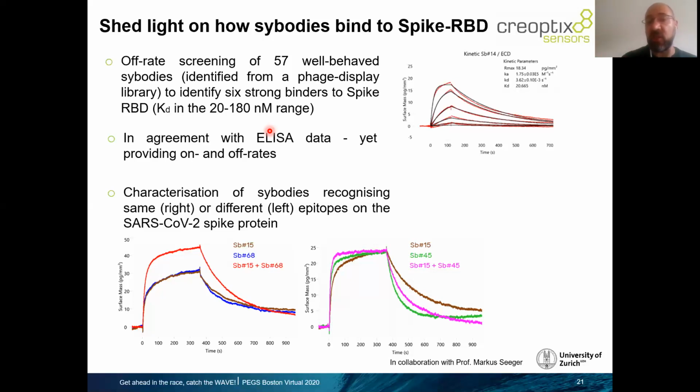Of course, we could imagine that you can take all these sybodies, synthetic antibodies, from the periplasm. There is nothing that can speak against that because we can do very crude samples. So you don't even need to purify those sybodies. But also after you have selected your hits, your strong binders, you can characterize them further.